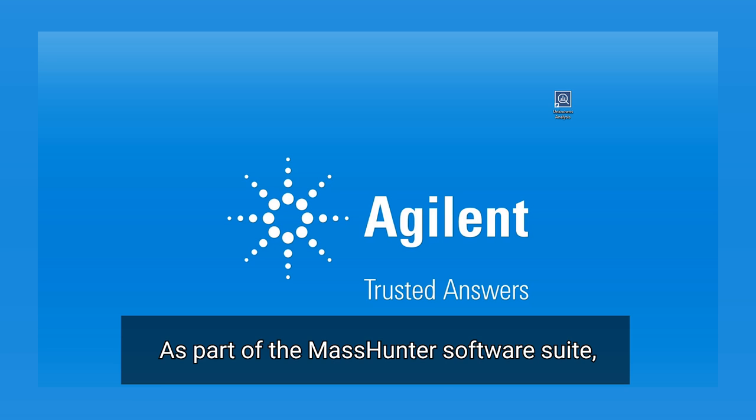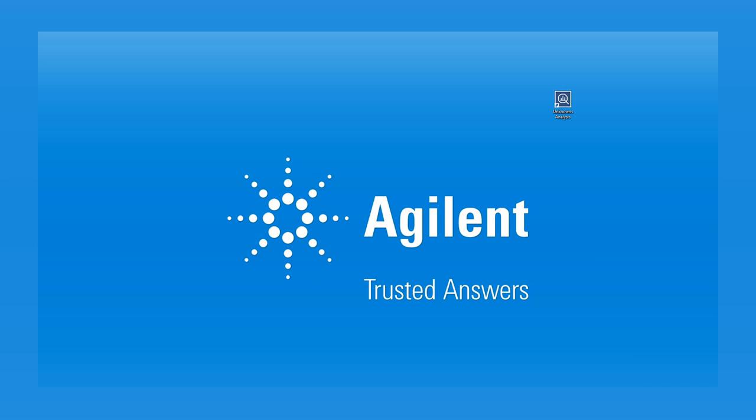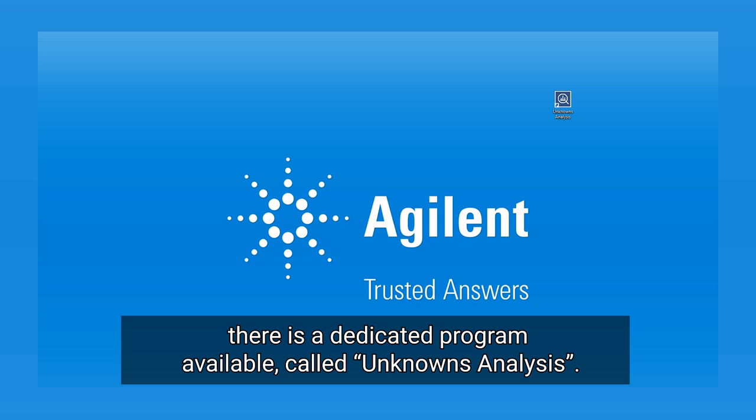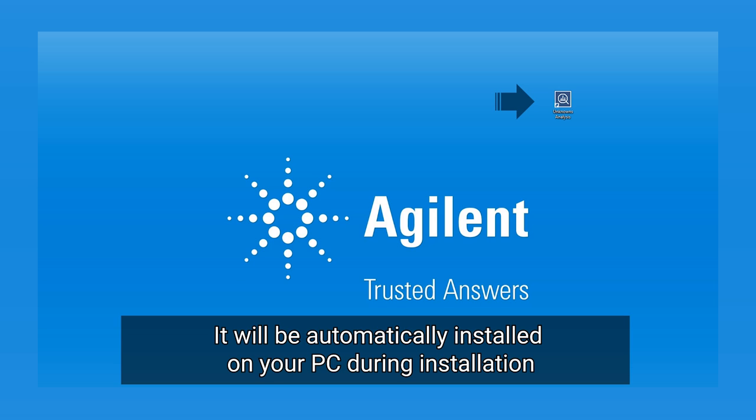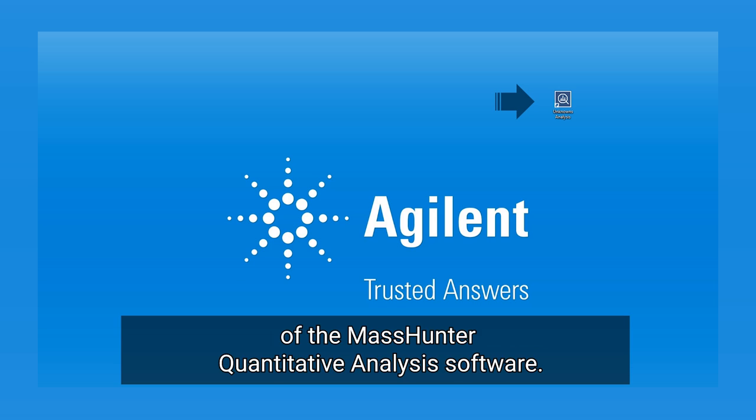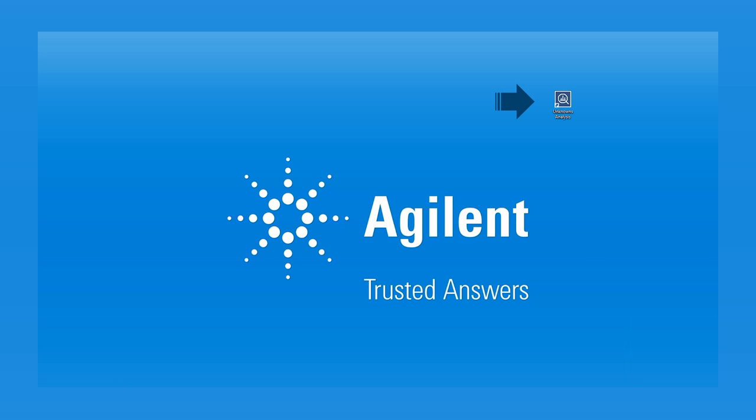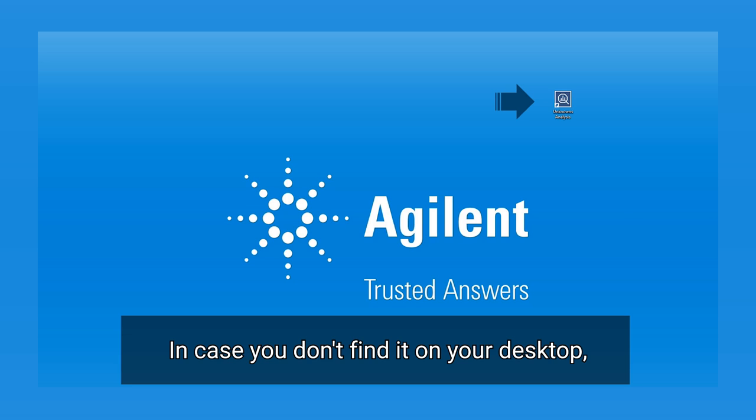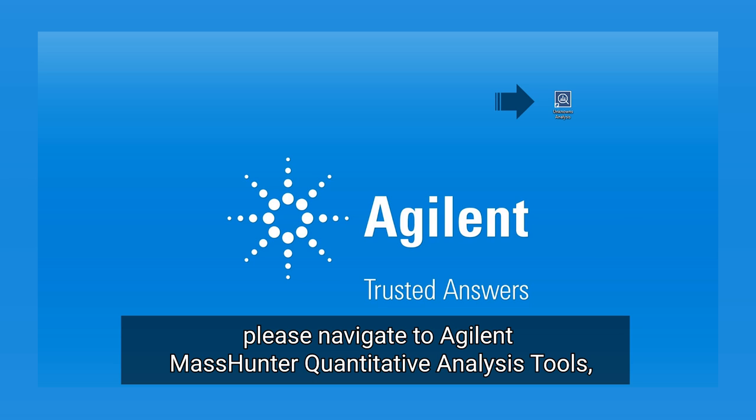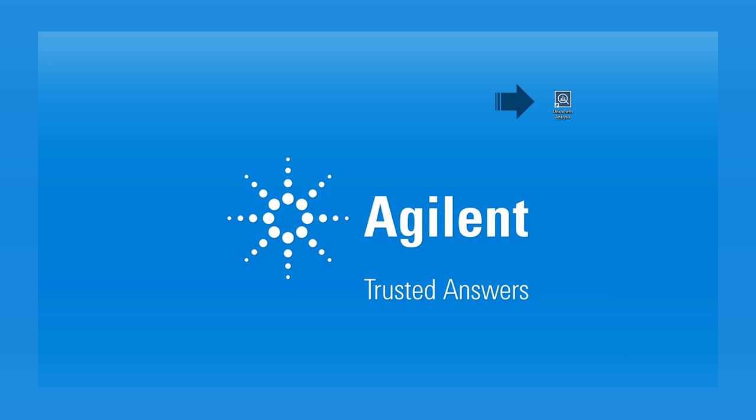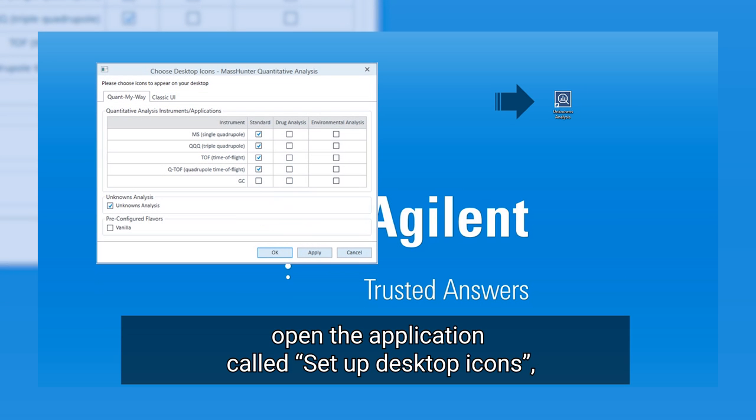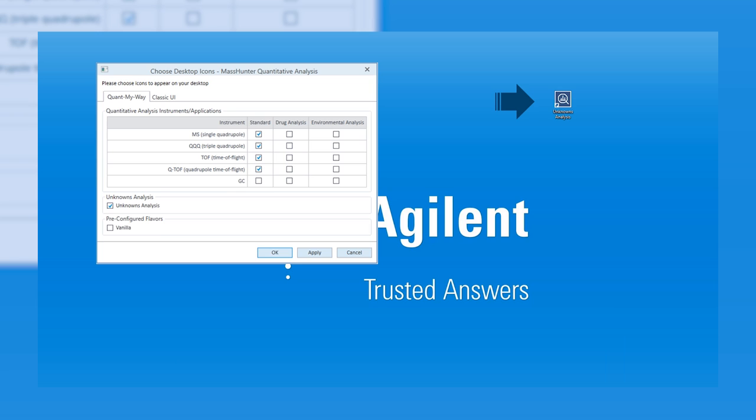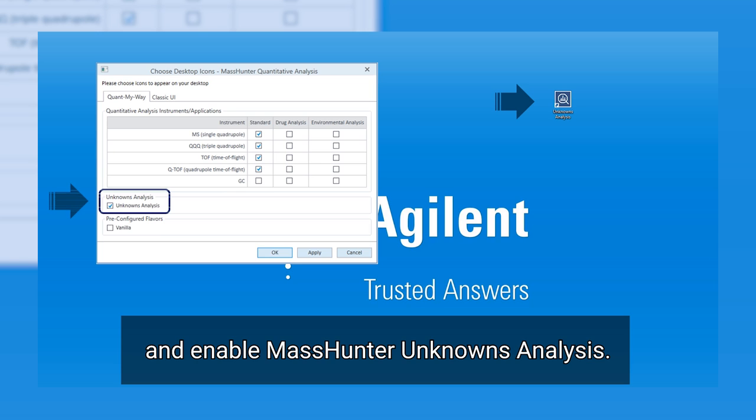As part of the MassHunter software suite, there is a dedicated program available called unknowns analysis. It will be automatically installed on your PC during installation of the MassHunter quantitative analysis software. In case you don't find it on your desktop, please navigate to Agilent MassHunter quantitative analysis tools, open the application called set up desktop icons, and enable MassHunter unknowns analysis.